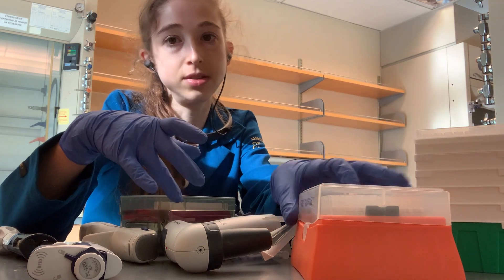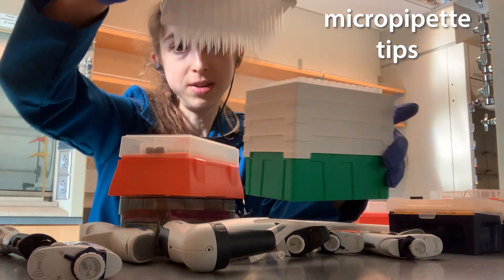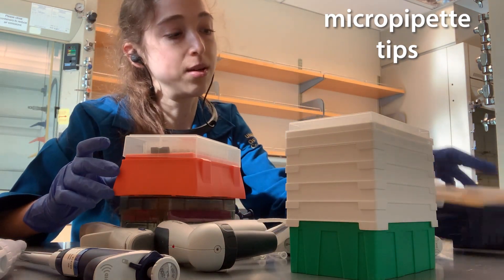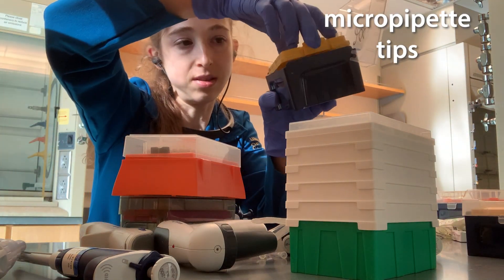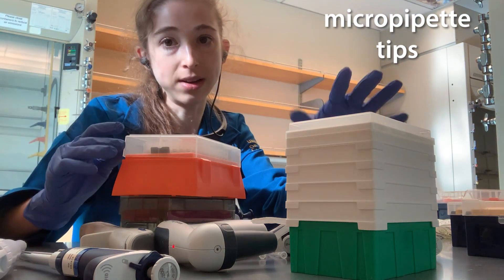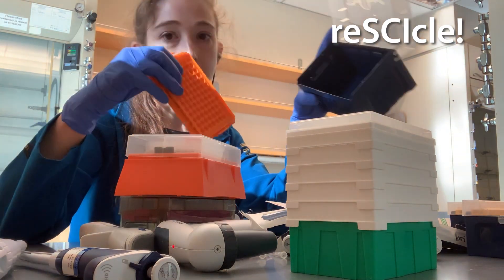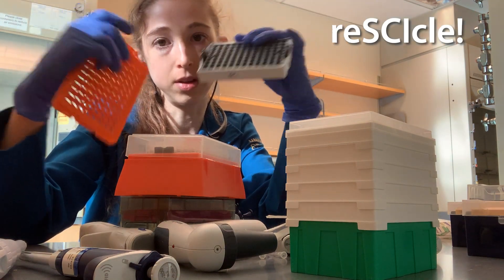When it comes to the tips themselves, sometimes they come pre-packed in boxes. Sometimes they come in racks where you refill the box. I filled those so many times — those racks just kind of tip over. Other times, the racks come out and you replace them with one from the stack and put the top back on. When you take the empty tray out, they just come right out. And what's really nice is: don't get rid of them — you can tape them together and now you have a PCR rack to go with.